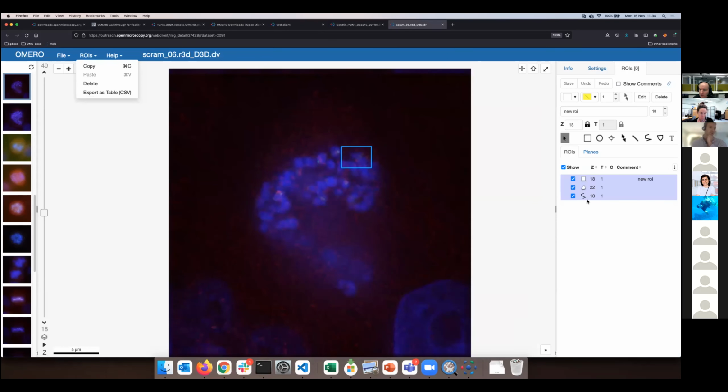It goes into a database, according to what? Yes, absolutely. So you can imagine the database as a kind of cloud of objects, which are hovering above the original file, which is sitting at the back and bottom of all things, and is only being referred to, not manipulated with. You see the difference. There is simply a link, a thread on which the file is hanging, and you can then imagine a so-called graph with nodes and lines between them, and the whole balloon of objects is hanging on that.